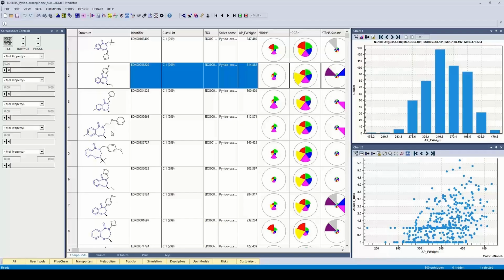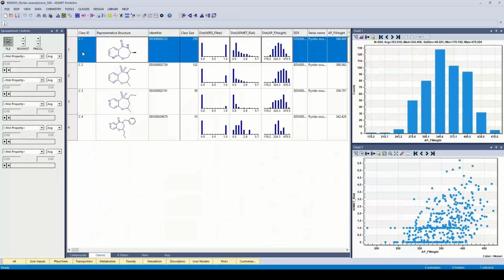This kind of alignment is actually something you can do pretty easily in MedChem Designer alone. However, you would have a limit of 100 compounds. So as you can see here, you have a core and R group motif. The logical next step is to say, well, I really would like to see a core and R group decomposition for these molecules the way that these compound series were initially designed.